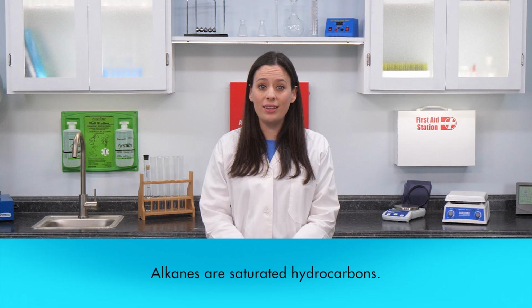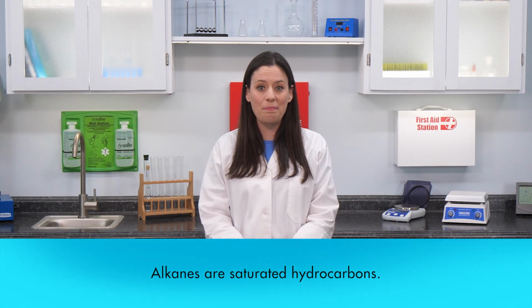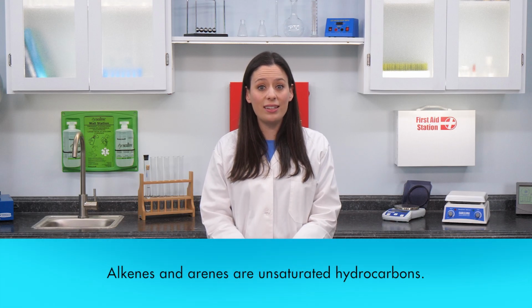From this experiment, we confirm that alkanes, such as cyclohexane, are saturated hydrocarbons. We also confirm that alkenes and arenes, such as cyclohexene and benzene, are unsaturated hydrocarbons. Knowing whether an organic compound is saturated or unsaturated is important to our health, as we will see in the next lab. At this time, proceed with the corresponding activities.